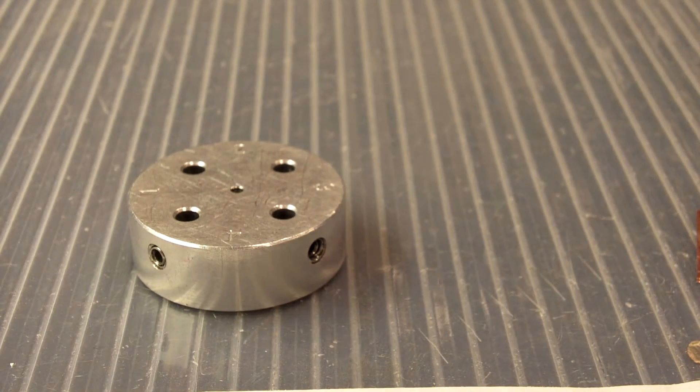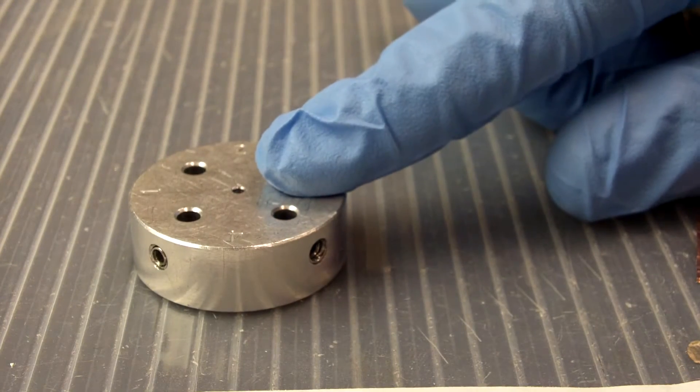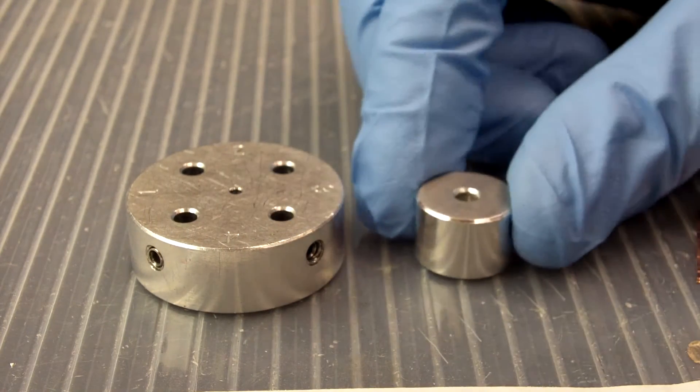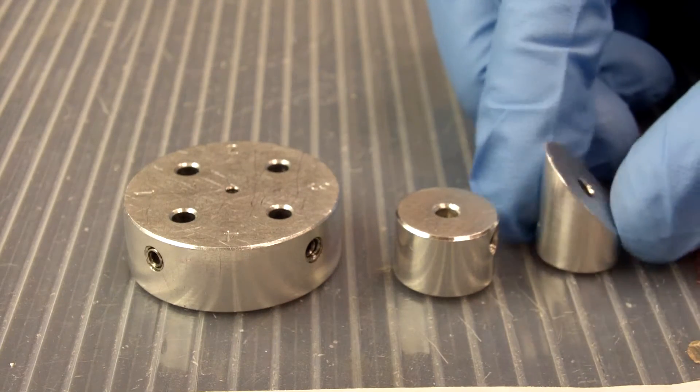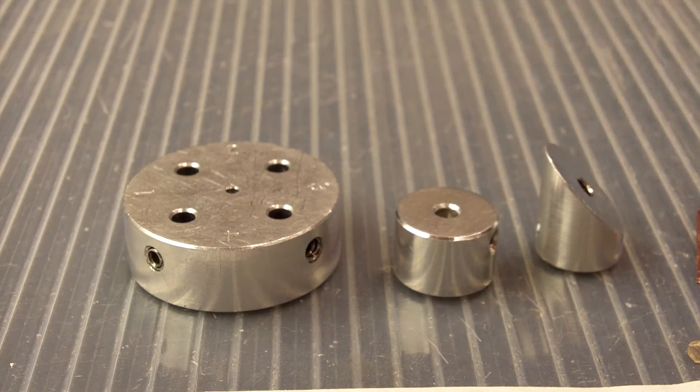And we have a few different kinds of these. This big one holds four samples, of course. And then we have this small one that will hold a single pin stub. And then we have this one here that's tilted at 45 degrees if we wanted to tilt our sample inside the microscope.